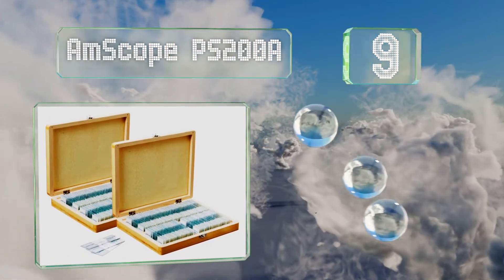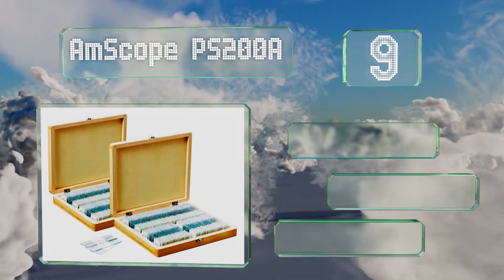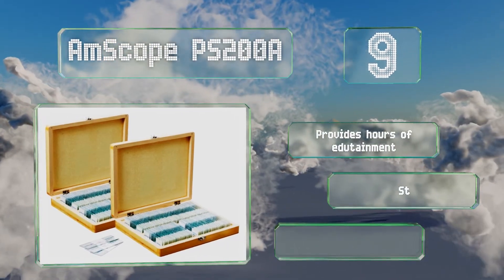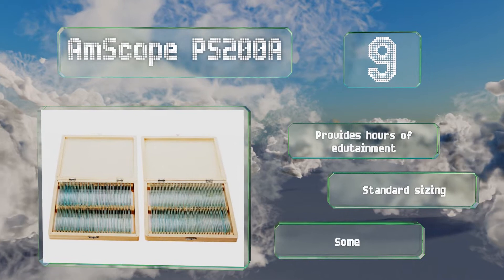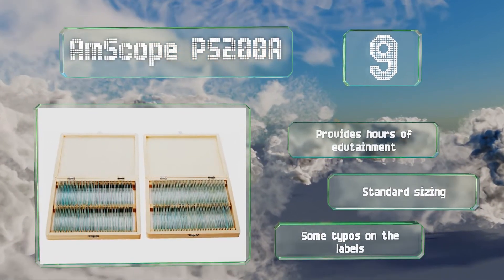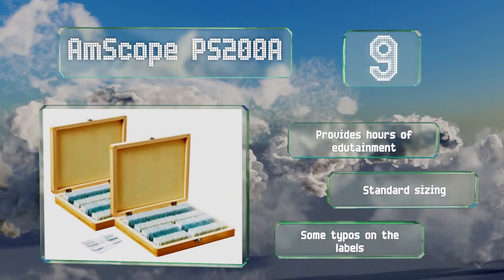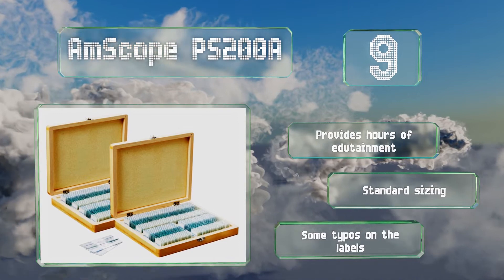At number nine, including animal, plant, and insect tissues, the AmScope PS200A features a wide variety of cross sections, hole mounts, longitudinal sections, and smears. This set of 200 is arranged in two boxes with sturdy latches to help you keep them organized neatly. It can provide hours of edutainment and comes in standard sizing, but there are some typos on the labels.